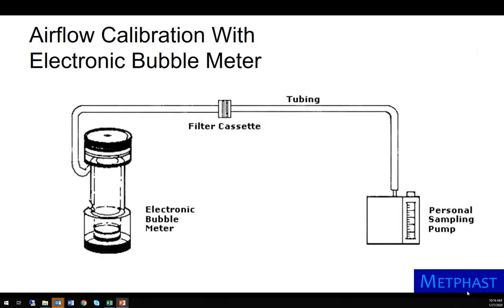The air flow calibration setup with the electronic bubble meter is shown here. The top of the electronic bubble meter is connected to the sampling train. The same procedures mentioned for the manual soap bubble meter are used to determine air flow.